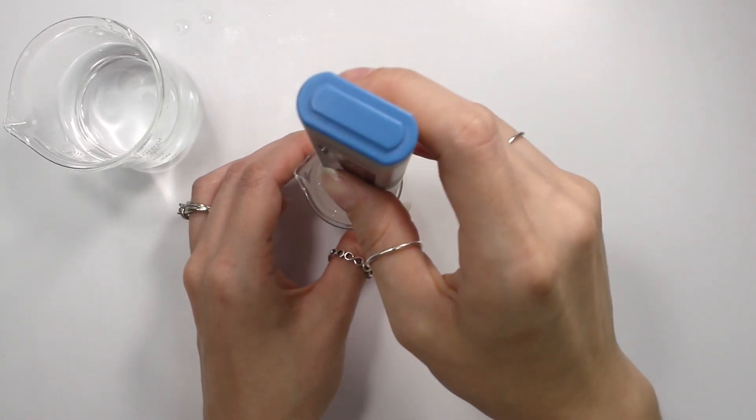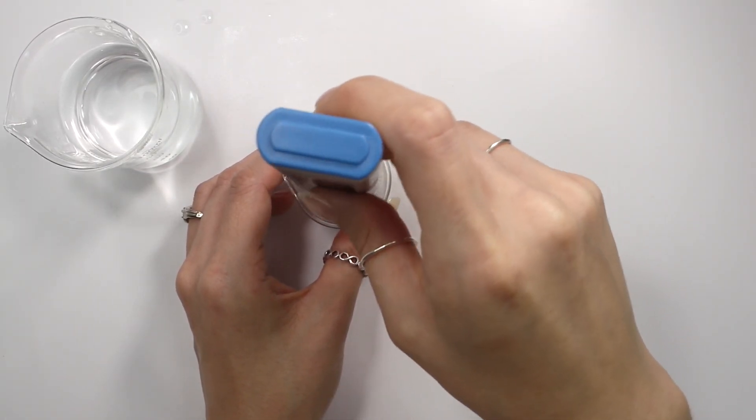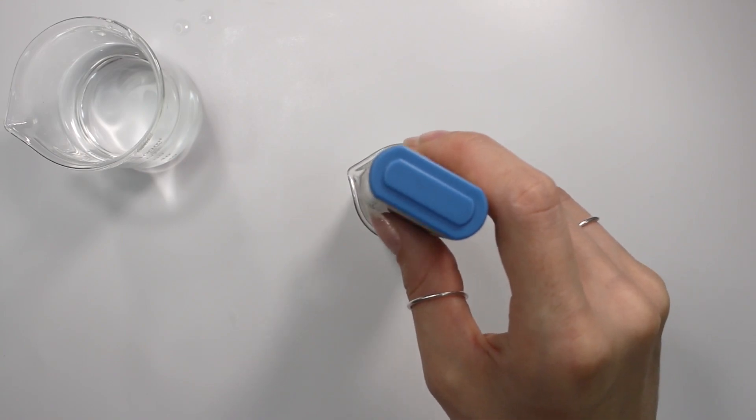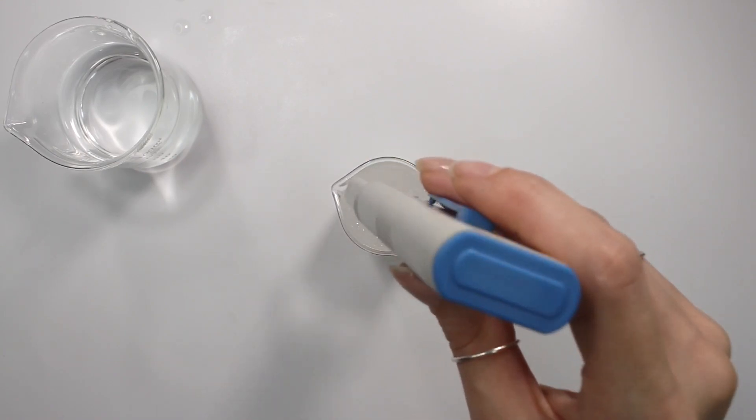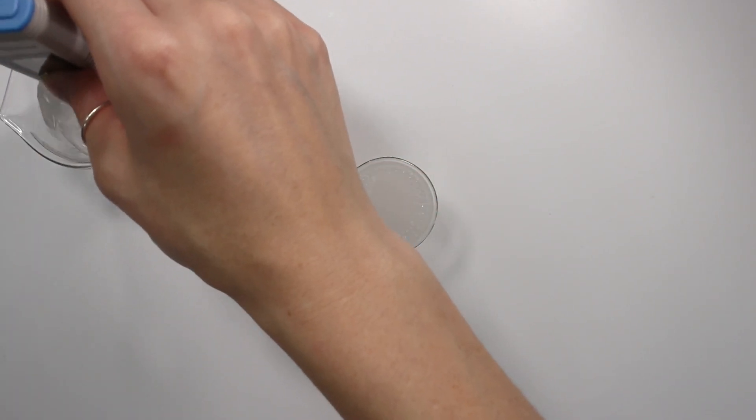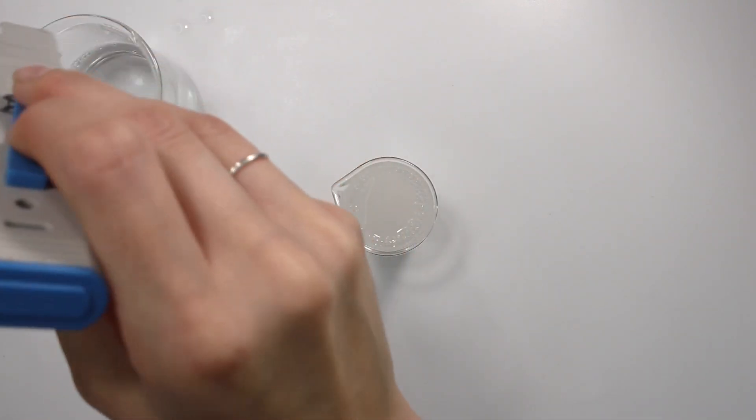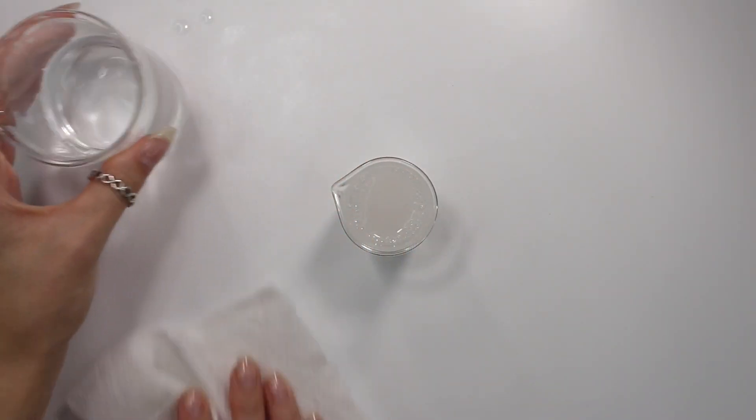So let's take the pH with the cheaper pH meter. Again, dip it in your distilled water and then swish it around in the solution for about a minute. And this one is reading 7.17. So again, off by about 0.20. So we can totally say now that this cheaper pH meter is off by 0.20 compared to the more expensive pH meter.